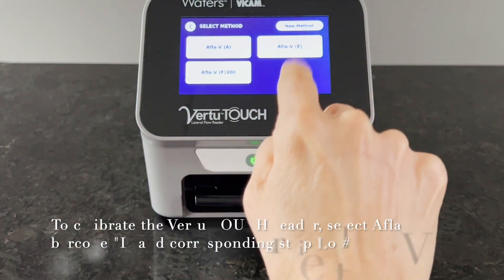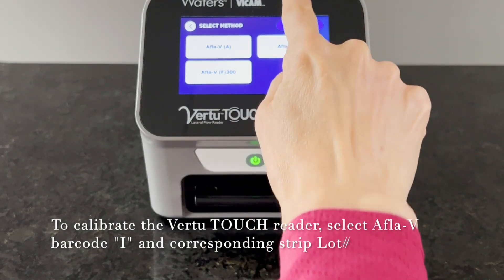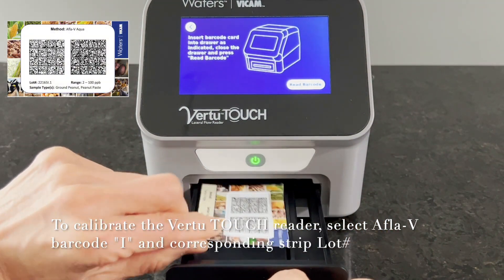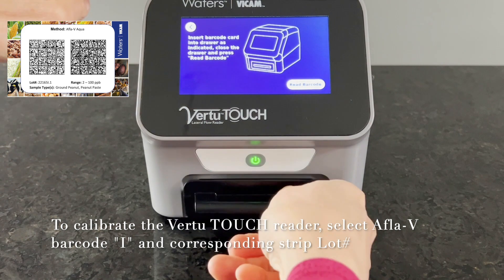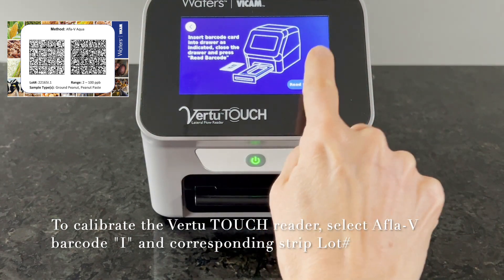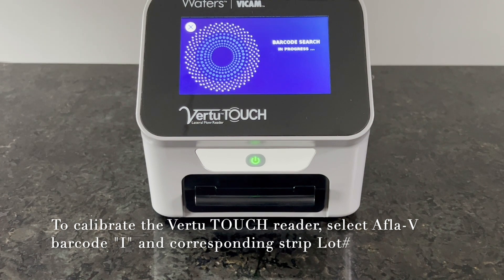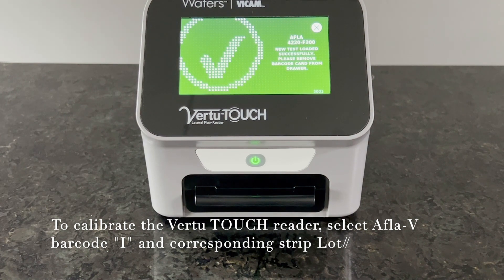Start by calibrating the Vir2 Touch Reader using the barcode supplied with the APLA-V Aqua BT Peanut Kit. For this method, we'll enter barcode I. Once the calibration barcode is scanned, the Vir2 Touch Reader is ready for sample analysis.